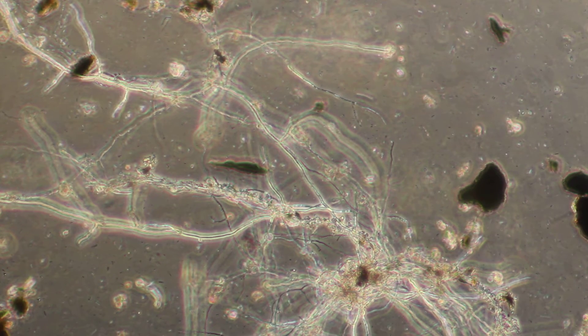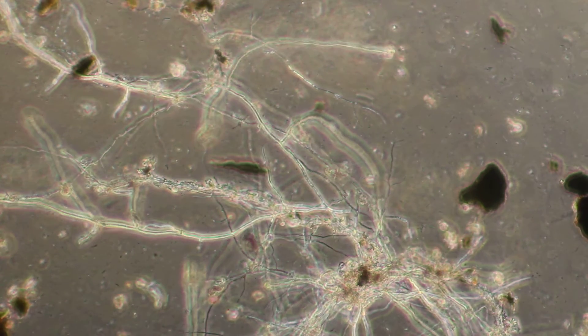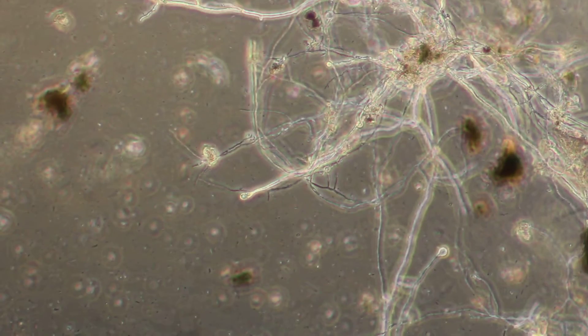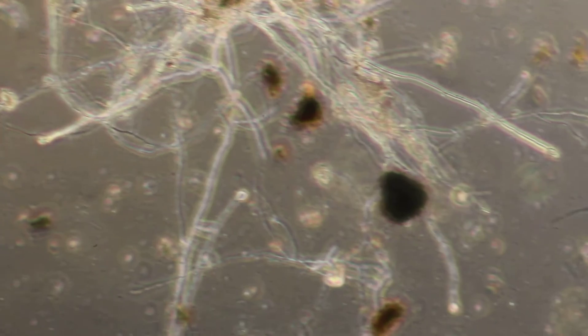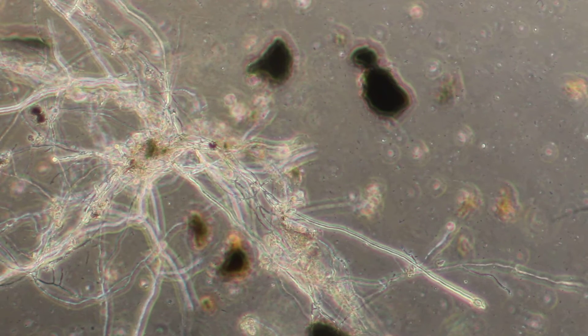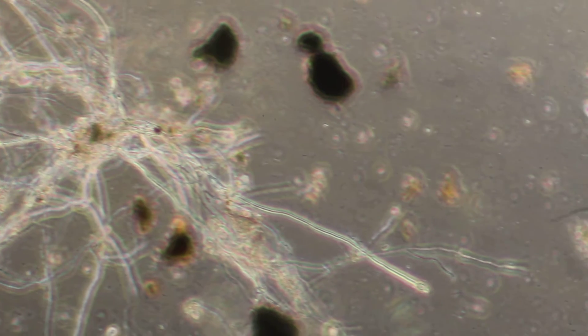So I've got to say this surprised me, but in a good way. This is our soil mix — just our regular soil mix with a little bit of added molasses to it. And I found the best fungal strand that I've found on any of my samples so far in this batch.